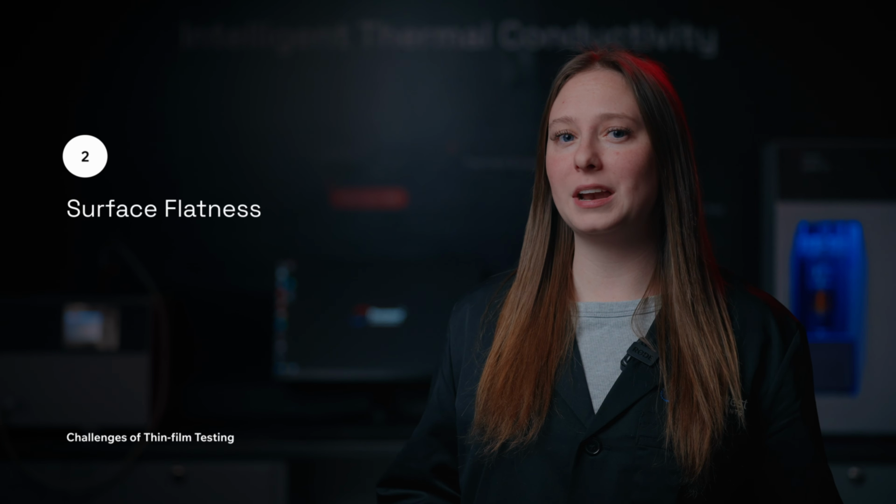Thin materials can bend, curl, or even wrinkle easily. Even minor waviness prevents full contact and increases contact resistance. The third is pressure uniformity. Thin film testing relies on uniform contact across the entire sample surface. Uneven pressure creates localized gaps, distorts heat flow, and adds error. And here's the tricky part. If these issues aren't controlled, the data can still look consistent from the test, but remain inaccurate.